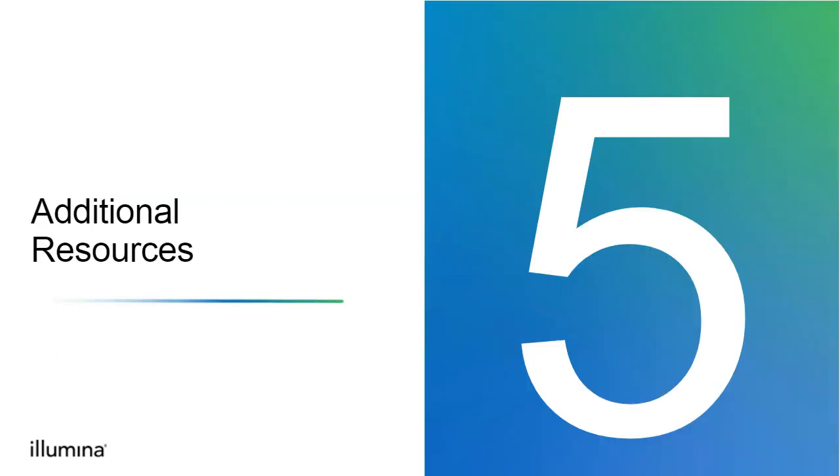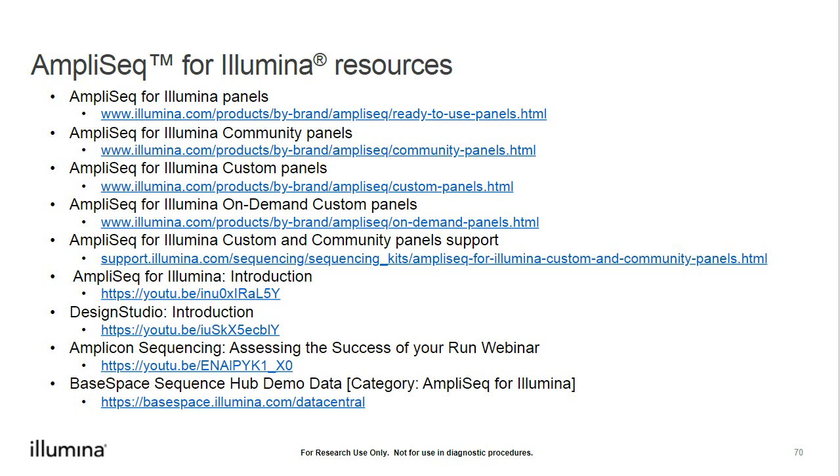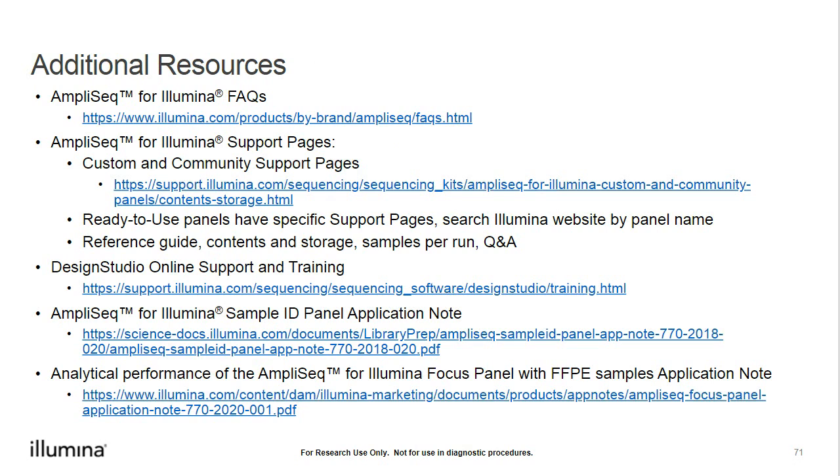To wrap up now, we will quickly go over some additional resources. I've included links here for more information on the AmpliSeq library preparation process, the panels, and custom panel design. There are also links to several more recorded webinars that you may find helpful. And here are just some additional resources with links for FAQs, support pages, and additional online training resources. I especially want to call out the last 2 items here, which are application notes, one for the Sample ID panel, and one that can be useful if you're working with FFPE samples.